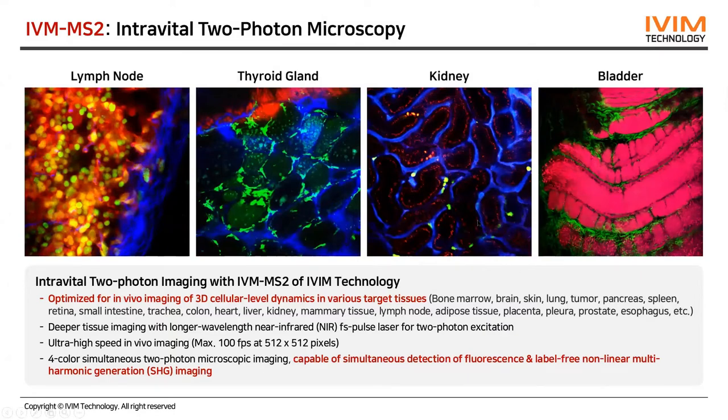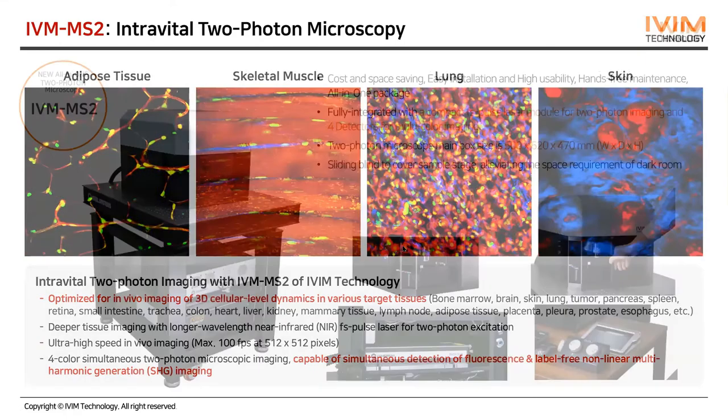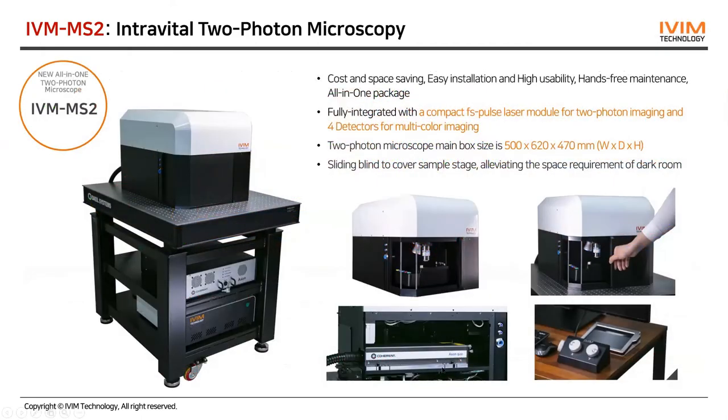Okay, so let me move on to the next question. So from Mark: is it possible to perform laser ablation, laser cutting with our two-photon system? With customization it's possible, but for laser ablation, we need a higher laser power. Actually, we typically use a relatively lower power model for the laser. We need higher power budgets, but it can be doable.